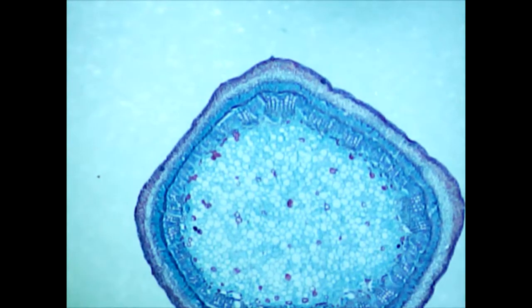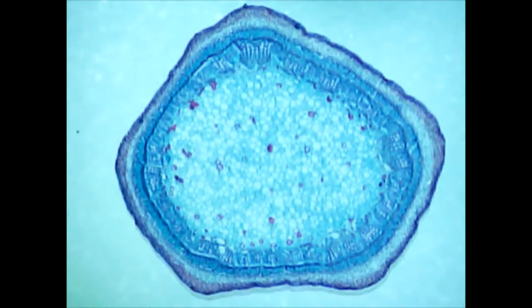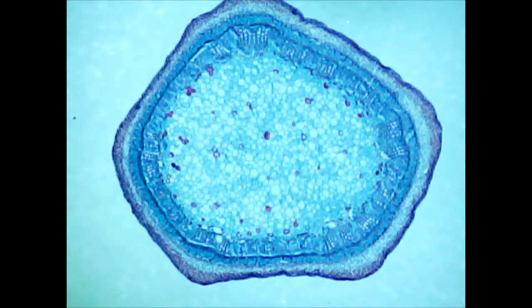Hello, in this video I will show you a stem of Cotton X.S. seen under Bresser USB digital microscope. Now you see 20x magnification. As you can see, the whole plant is seen. Keep in mind that this is colored. If you take a preparate and put it under microscope, you won't see such details.